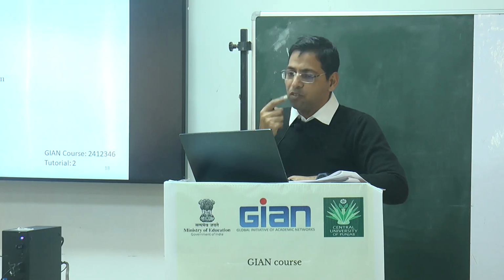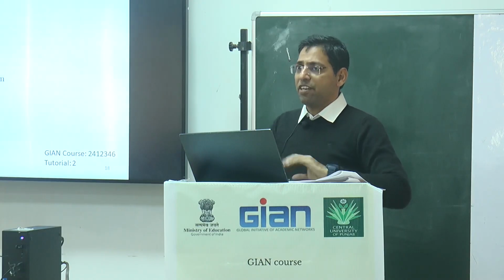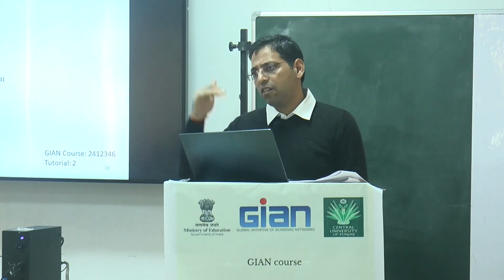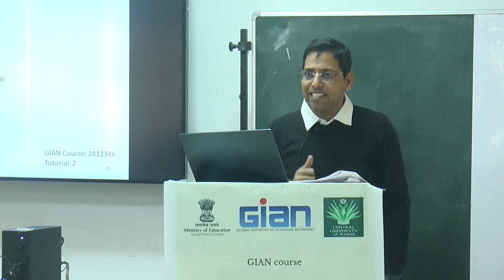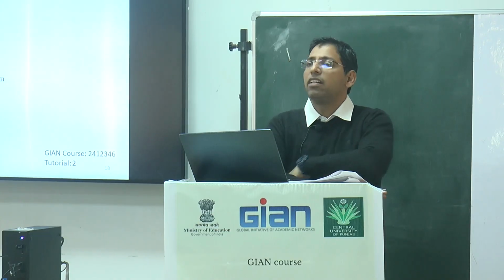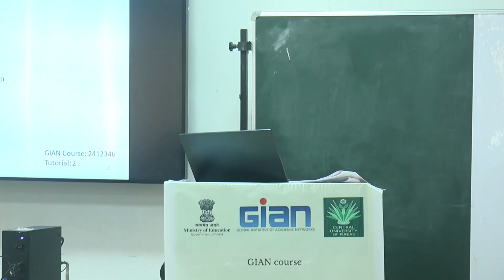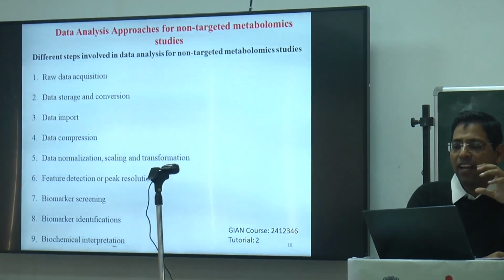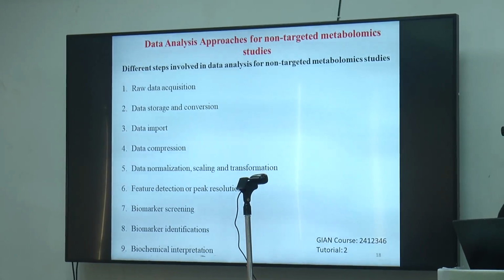So now I am coming to non-targeted metabolomics investigations. Whatever I told you before were the different files and pipeline for targeted metabolites by LC. Here you have to go ahead with nine different steps, in a stepwise manner, starting with raw data acquisition, data storage and conversion.